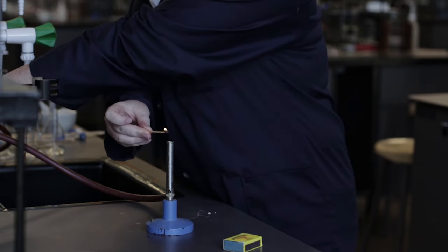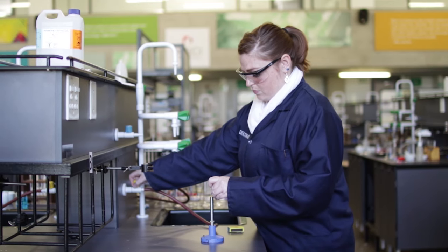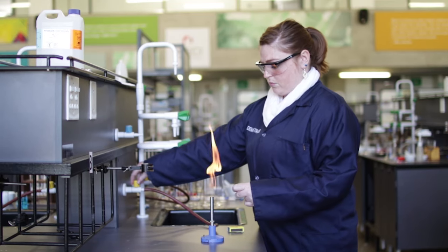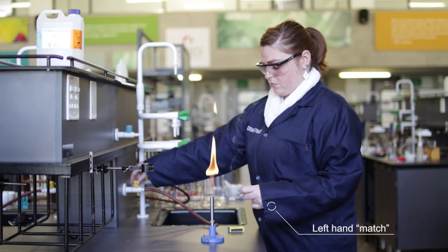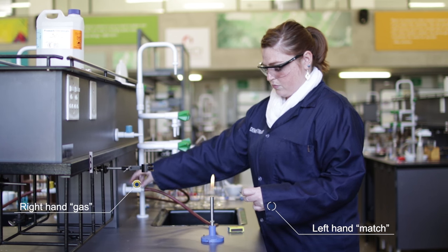A rule of thumb is, if the Bunsen burner is on your left hand side and the gas tap is on your right hand side, the lit match will be in your left hand and your right hand will open the gas tap.